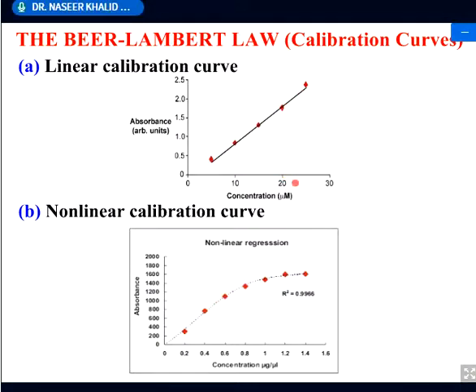Okay. Now, there could be certain situations where, although we are increasing the concentration, and this is the absorbance value, it is not a straight line like this.